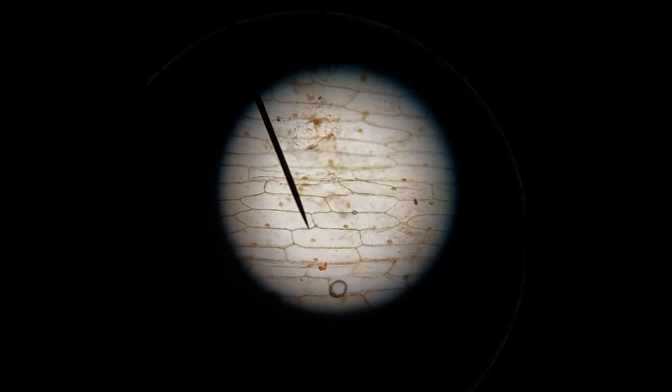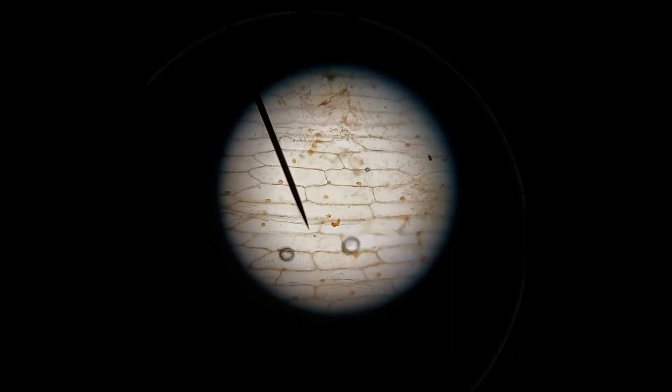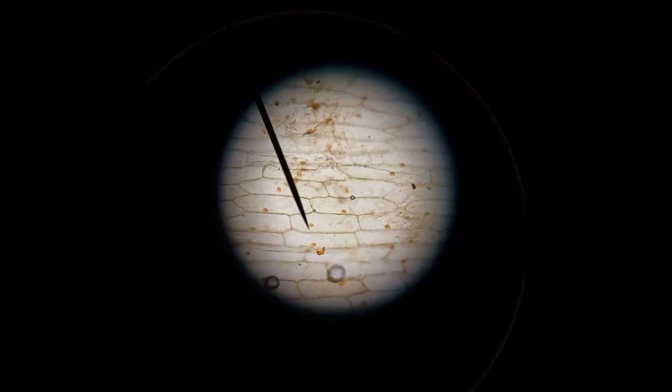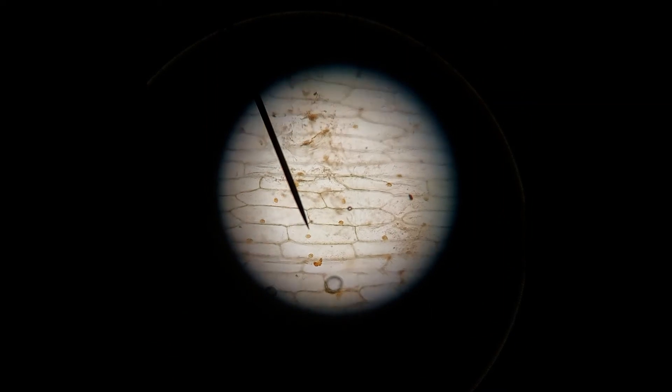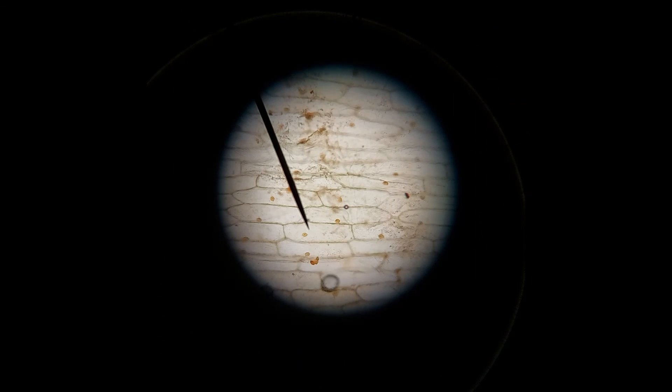Well, there we go. And as you can see, I will show you again. The nuclei are very clearly seen there. There's my needle resting close enough to a nucleus, as you can see.